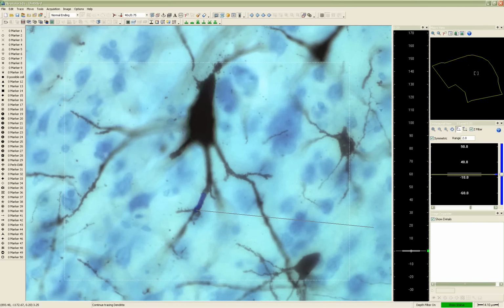So I'm going to pause right now just to see if there are any questions about this very basic part of tracing before we move on to other topics.